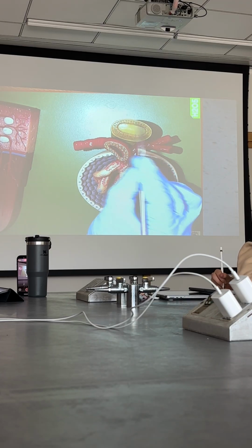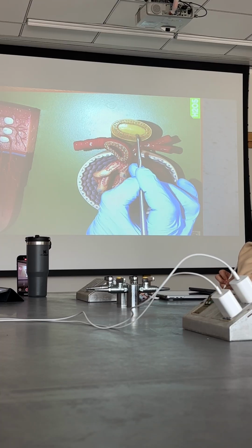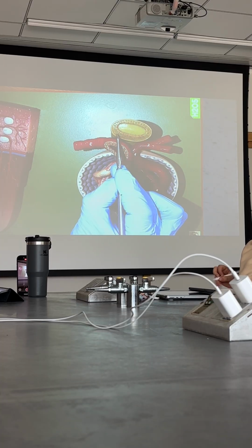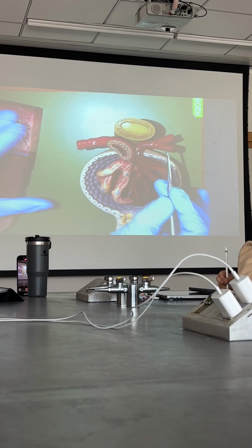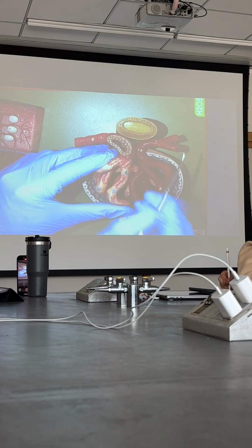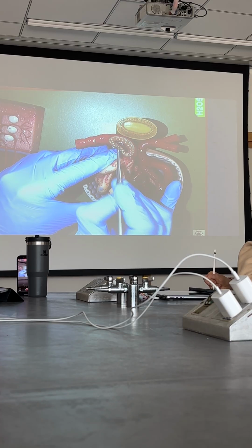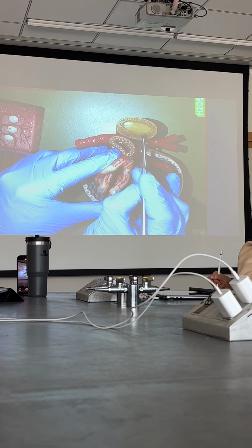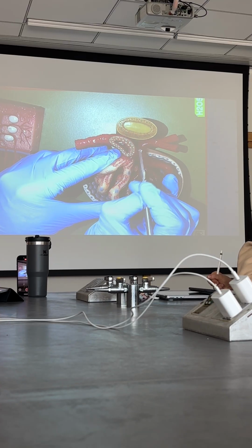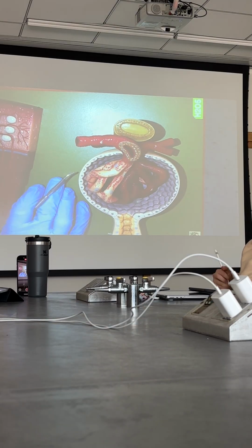What you're seeing here in this greenish yellow color is the last part of the ascending limb of the loop of Henle. And in the wall there would be some pushed-together cells that they refer to as the macula densa. So that would be right there. Sitting right next to it, over here, is the wall of the afferent arteriole, and in that wall are some specialized smooth muscle cells called the juxtaglomerular cells. So this whole area here would be the juxtaglomerular apparatus, in close-up.